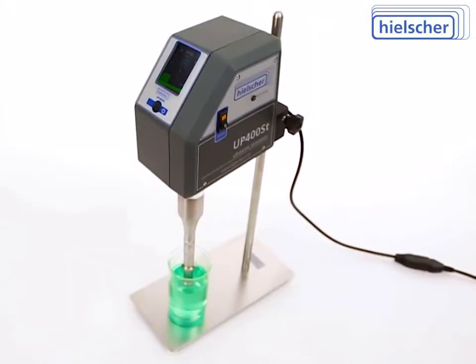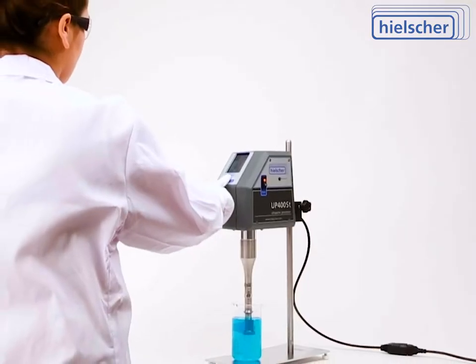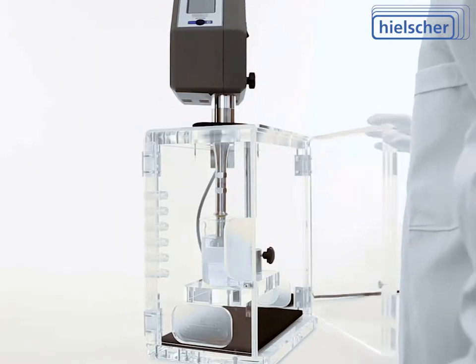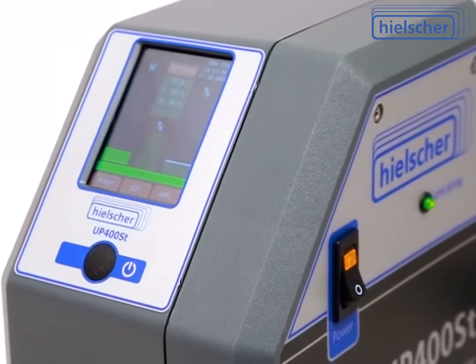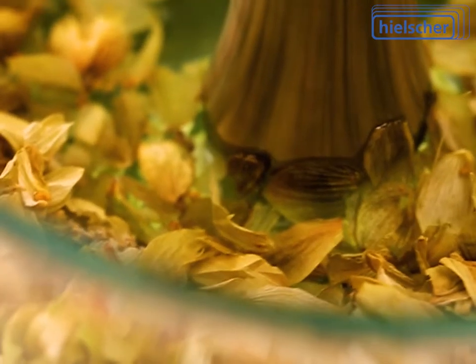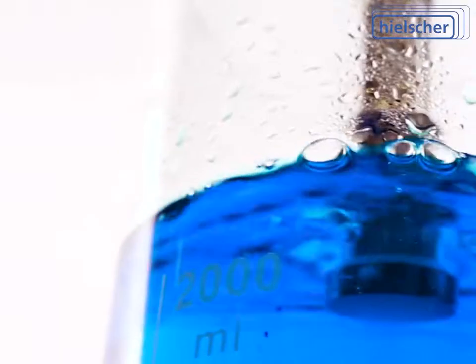The high-performance UP400ST is your perfect ultrasonicator for a wide range of applications in research and development, as well as for the production of smaller batches. Many universities and corporations worldwide use the UP400ST for sample preparation, botanical extractions, dispersing and emulsifications like clear nano emulsions, degassing, and general ultrasonic mixing.